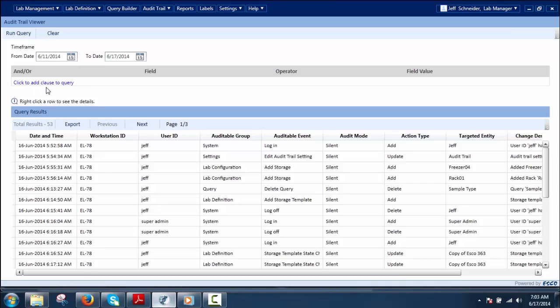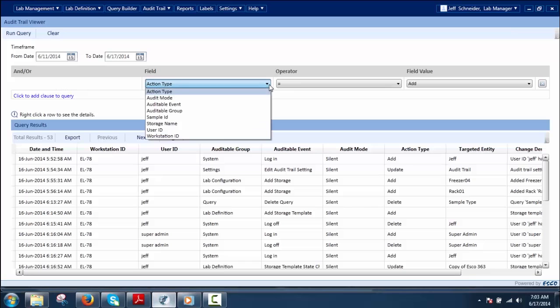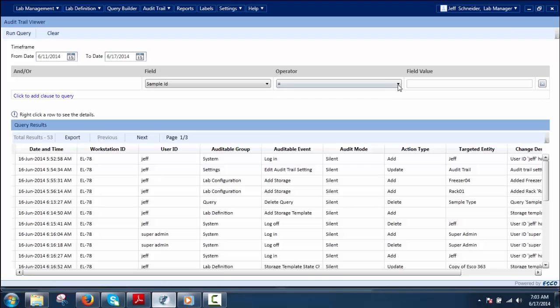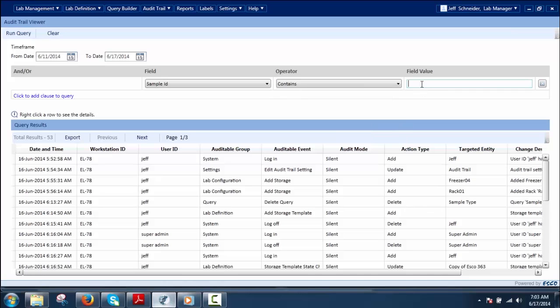Additionally, the user can define a clause and time frame together to sort the results. Click 'Click to Add Clause to Query' to define a query for audit trail — it is similar to Query Builder. The field, operator, and field value can be selected with AND or OR clause. The operators are the same as in the Query Builder, and field values can be defined by the user or selected from a dropdown wherever applicable.